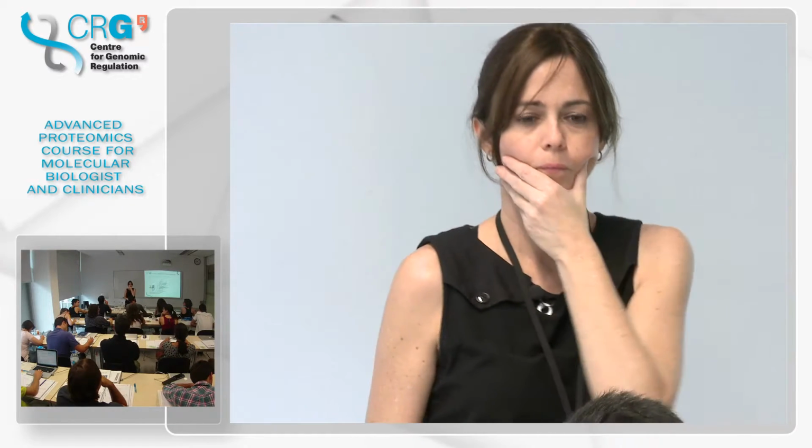So it's not that easy. In my lab, maybe I don't have a triple quad, but I can run these tests. If I want to make an SRM in my lab, I have an Orbitrap. Yes. And after, I move to a triple quad with my library. We do that all the time. And that's going to be your reference to compare those intensity ranks.